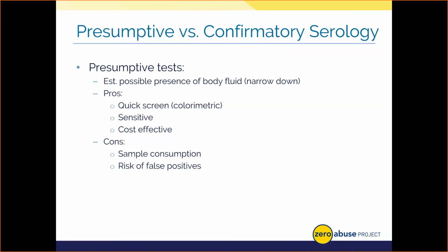Presumptive tests are typically highly sensitive, but they have a low specificity. What this means is, from an advantage stance, that we can detect very low level traces or dilute amounts of stains. But the tests themselves can be tripped up by other components and elicit false results, such as a false positive or false negative. In short, we may, in the case of a false positive, get a result that indicates a body fluid is present when actually it is not. Conversely, we could get a false negative, for which the sample comes across as not having a body fluid. In fact, it indeed does possess serological material.